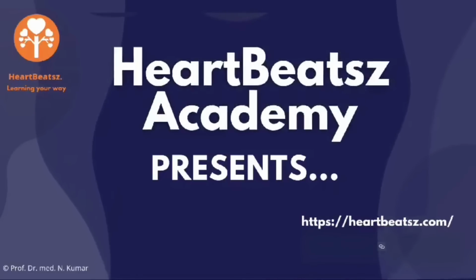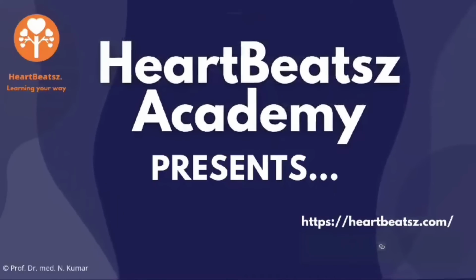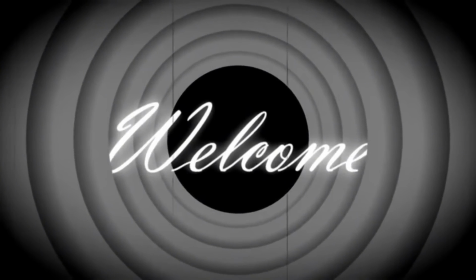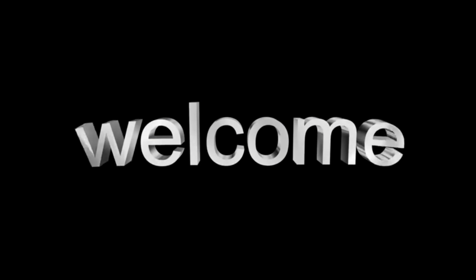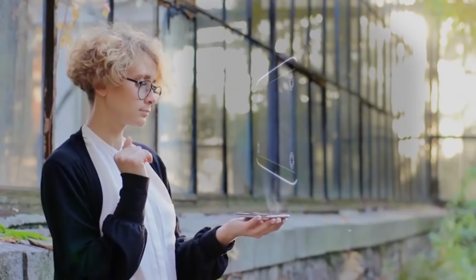Welcome to Module 3, where we'll explore some basic but essential techniques and equipment utilized in medical laboratories. A good understanding of these fundamentals is the foundation for all other areas of testing. Are you ready to learn? Let's begin. 1. Microscopy and specimen preparation.